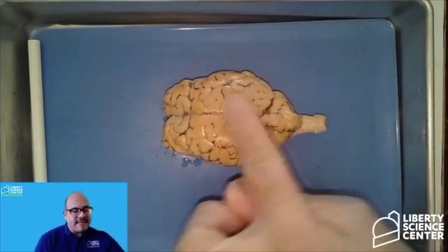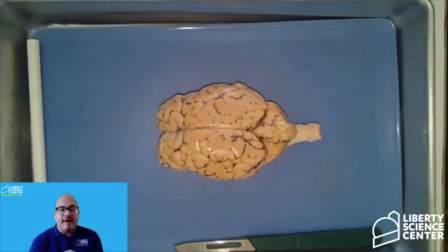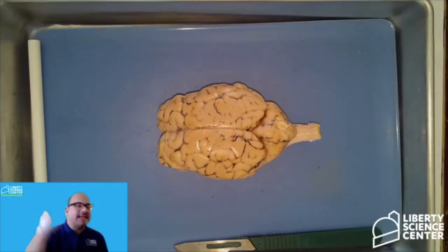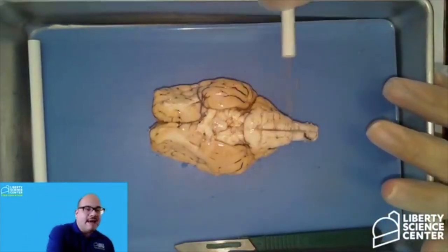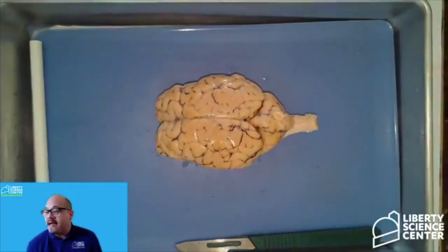When we talk about this area right here that we're looking at right now, it's called the dorsal section of the specimen. You've probably heard of dorsal fins. With whales, dolphins, sharks, they have that fin that sticks out on their back. That's the dorsal side. So for us, our dorsal side is our back. What you're seeing right now on camera with my face and my chest and my abdomen, my torso, that's the ventral side. So when we look underneath, that is the ventral side of the brain. Okay, so let's look at some of that external anatomy.